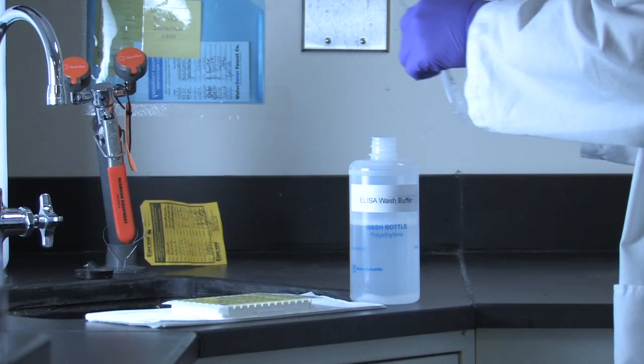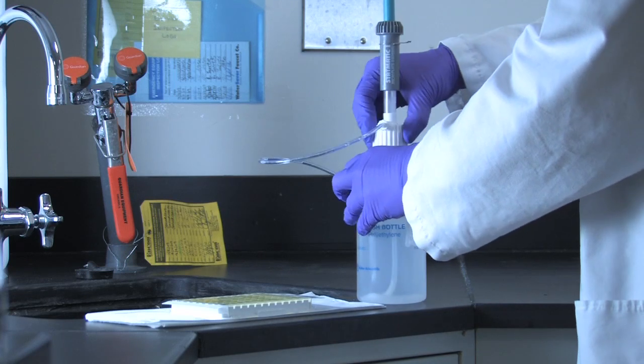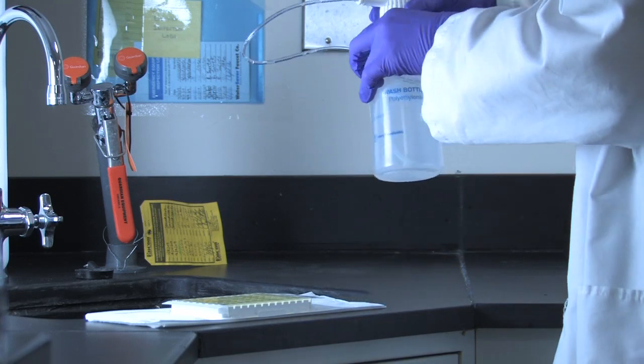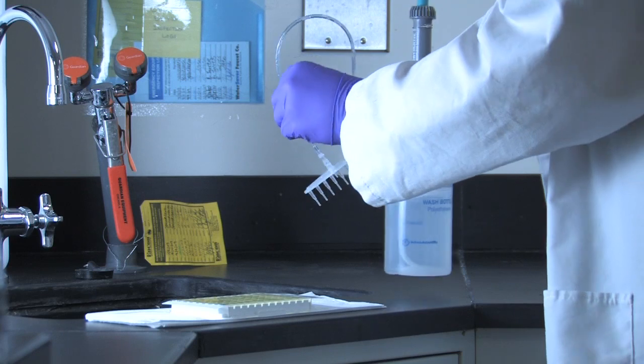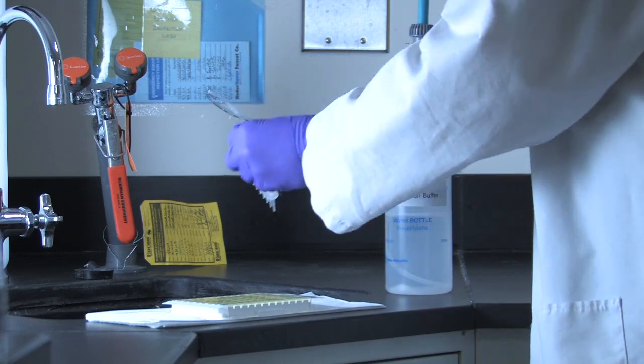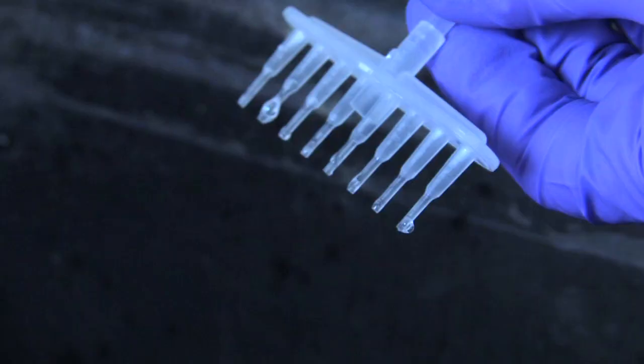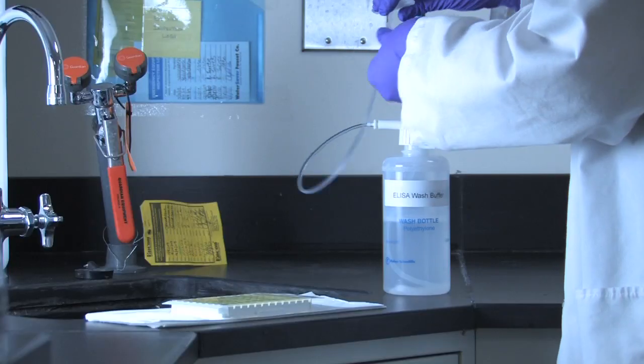Prepare wash buffer as specified in the protocol. Transfer the wash buffer to a clean polyethylene bottle and attach the appropriate wash nozzle or statmatic dispenser. Prime the dispenser until all bubbles have been removed.